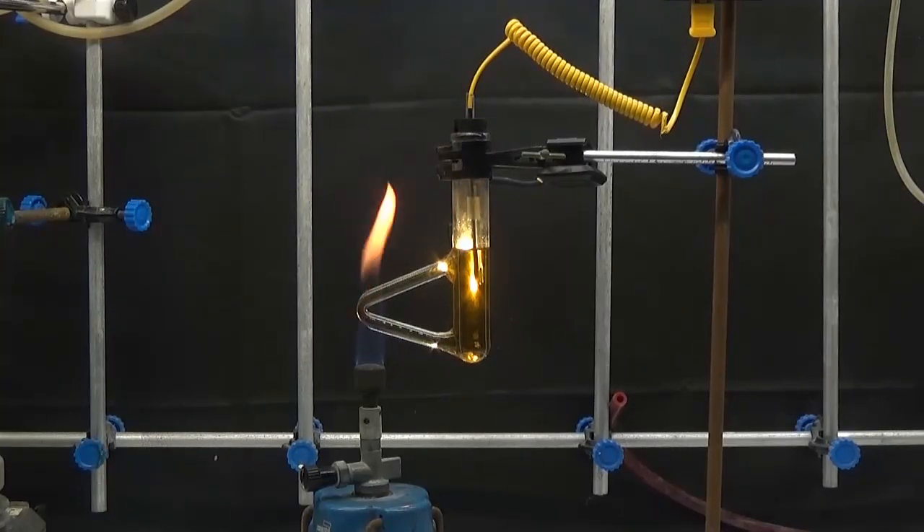The melting point was determined to be 178 to 180 degrees Celsius.